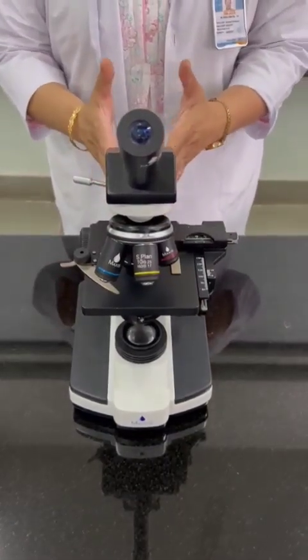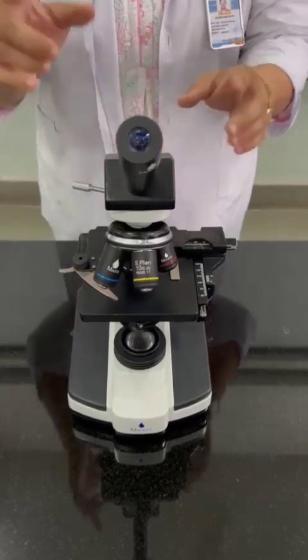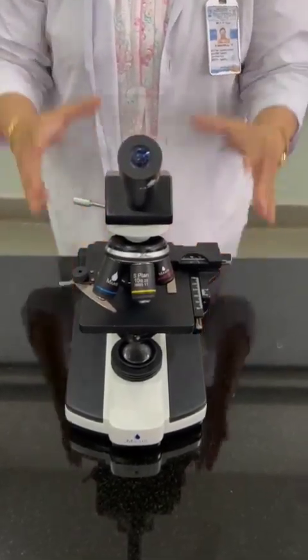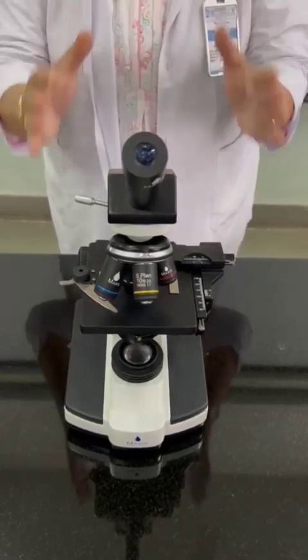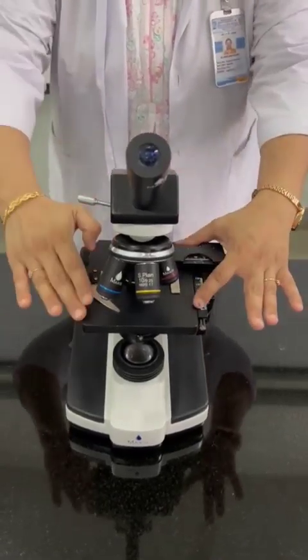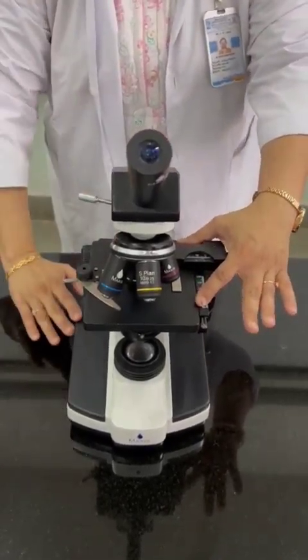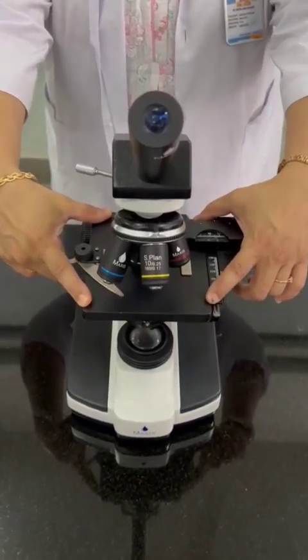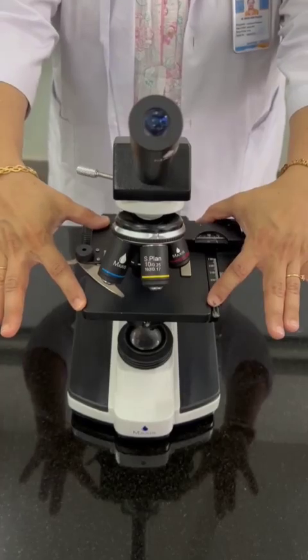Now let's discuss the different parts of a monocular compound microscope. To understand this microscope, we will divide its parts into suprastage parts and substage parts. This is the stage of the microscope. As the word suggests, it is a flattened area.